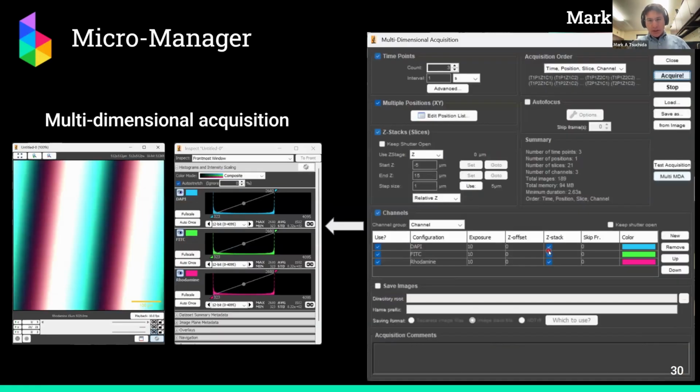Now, the main experimental interface is called multidimensional acquisition, which is shown on the right here. And this allows you to specify in a fairly simple interface a time series experiment, stage positions, and I don't show it here, but you can do things like create a grid or a multi-well plate position list, and then through focus stacks, and then channels.